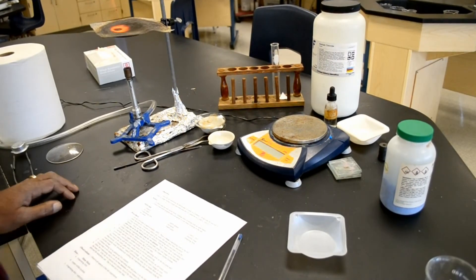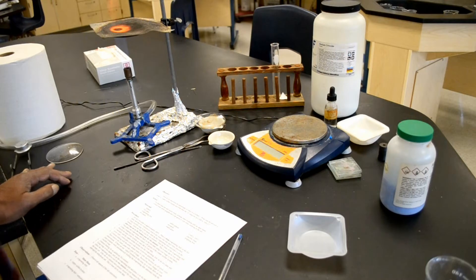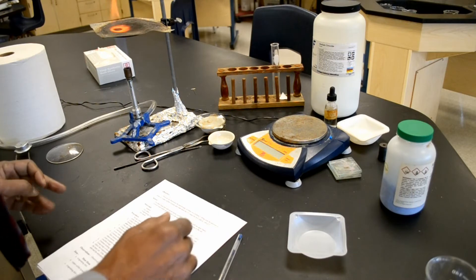Now for the procedure. Set up a hot plate to approximately 300 degrees Celsius. We'll be using a Bunsen burner for this activity, so we won't be using a hot plate. Place a clean evaporating dish on a hot plate or Bunsen burner and heat it for about five minutes to remove any water that may have been absorbed.